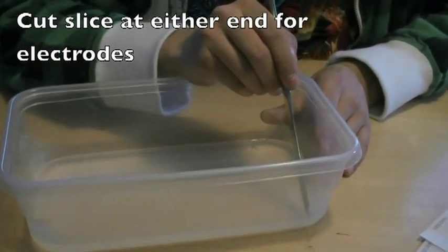Using the butter knife, carefully cut a thin slice from the gel from the top and the bottom to make room for the electrodes.